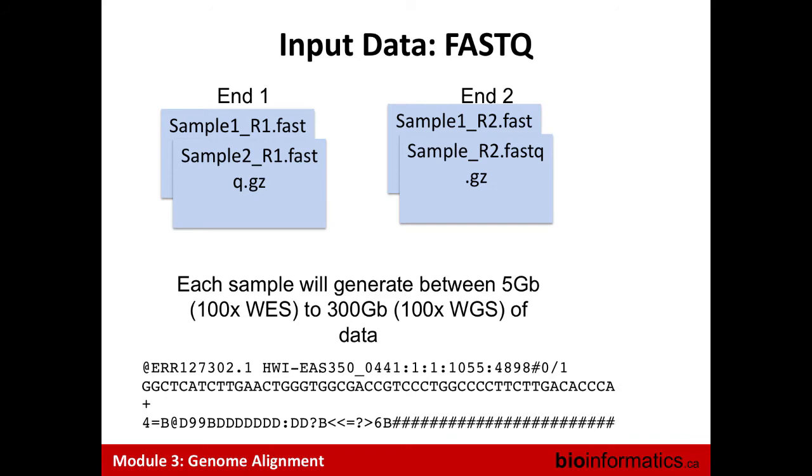And what is important, and a bit more complicated to understand, is the last line, the fourth line. The fourth line is the quality of your sequence. It means that each symbol represents a quality for each base of the second line. So why don't we use a direct number? Because quality is measured as a metric, so it's a number. But we cannot use a direct number because, for example, if my first base has a quality of 41 and the second base has a quality of 3, if I use numbers, I will have 4, 1, 3. So I don't know if 4 represents the first base, 41 the first base, or 413 the first base. So it's complicated if you use numbers.